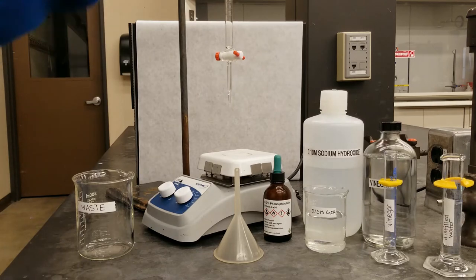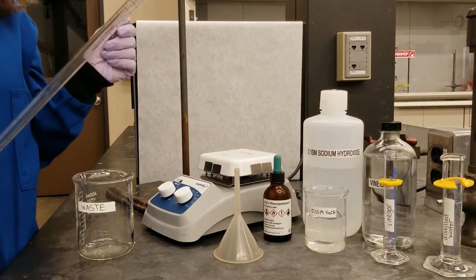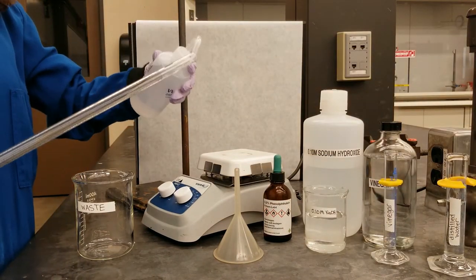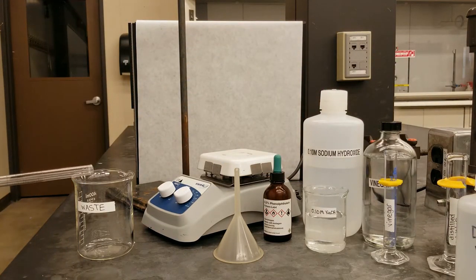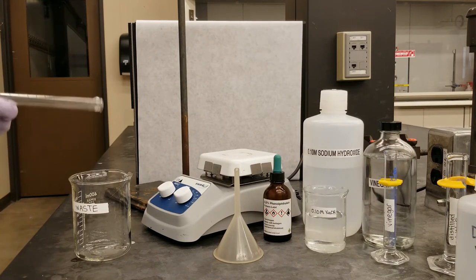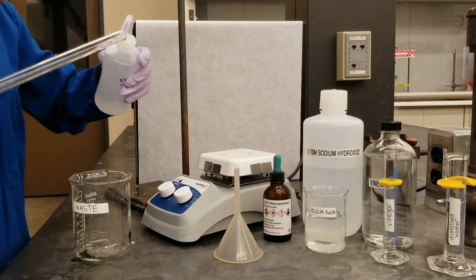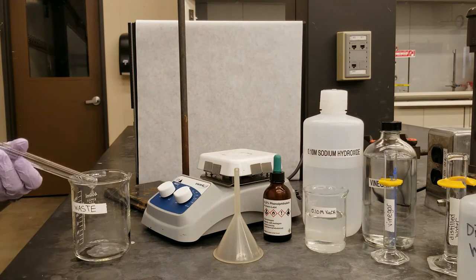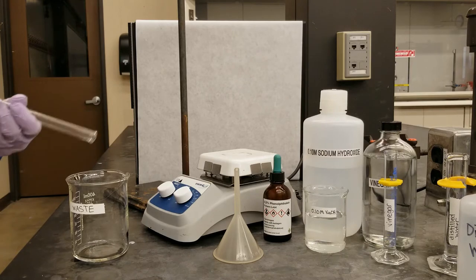So, before we begin, we're going to make sure we prime our burette. To prime our burette, we're going to be using some distilled water, to ensure that all of our sides are evenly coated. And you want to do this a couple of times. Once we've primed the burette, we'll add sodium hydroxide at eye level using our stool.